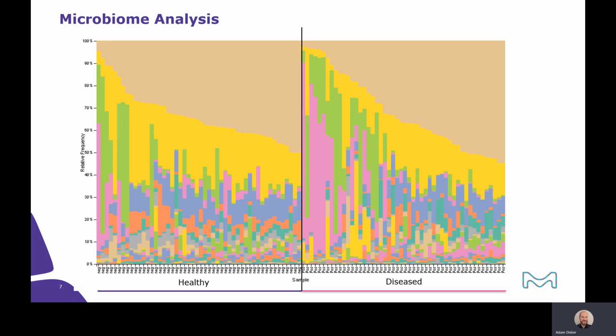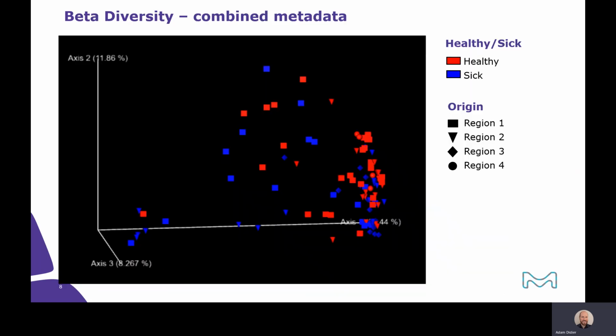The application generates stacked bar graphs as well, showing the different bacteria identified in each sample at different classification levels. A table of the taxonomic calls is also generated. This allows easy visualization of the differences between sample populations, like the diseased and healthy samples represented here.